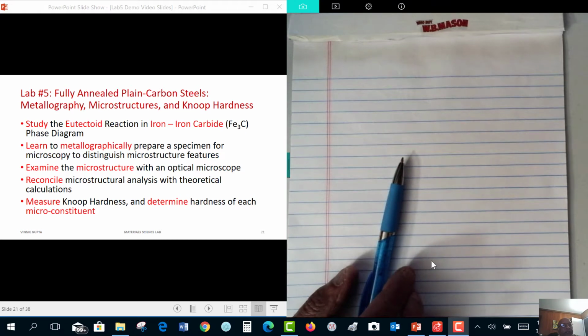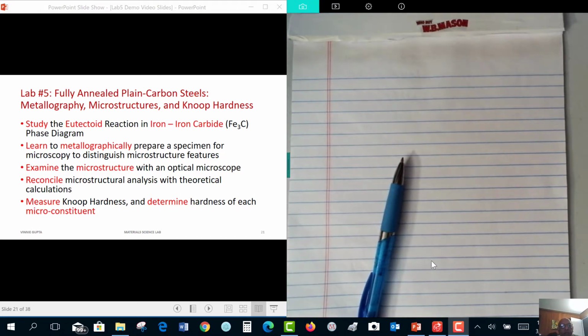Good morning, folks. We are into the third part of lab number 5. In the first part, I covered the theory of the eutectoid reaction in steels. Then in the second part, you saw that we prepared the specimens. Now in this third part, we are going to do the microstructural analysis.